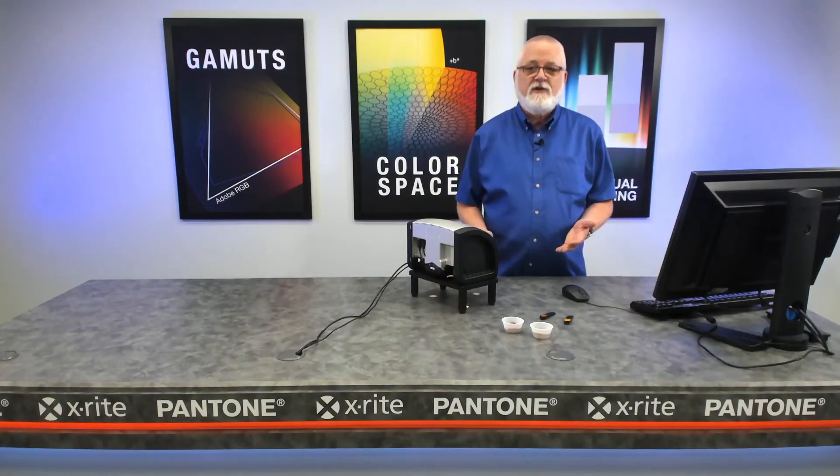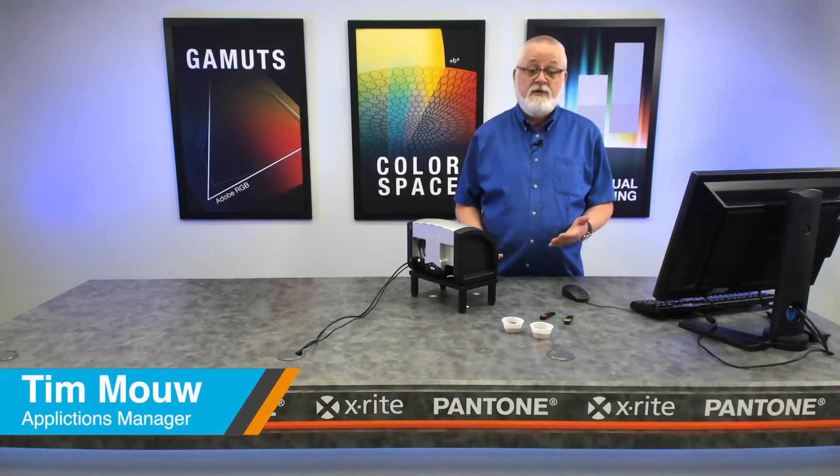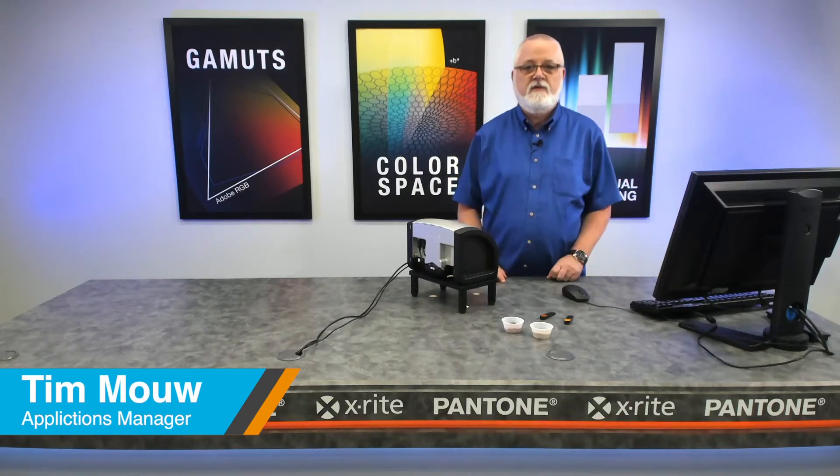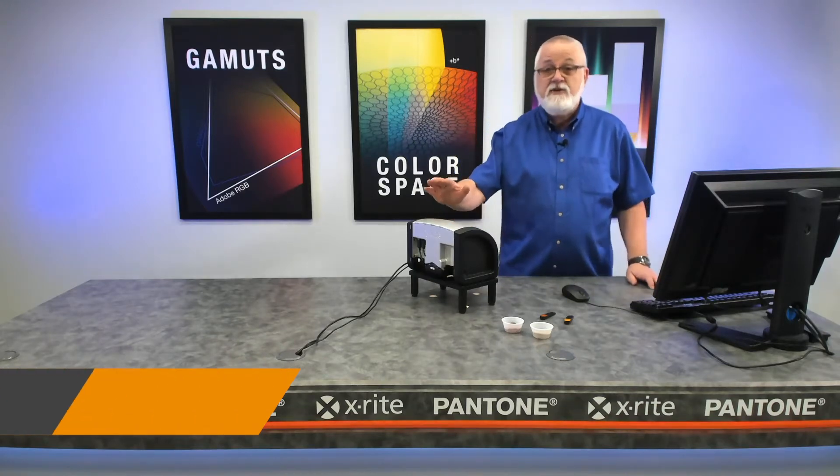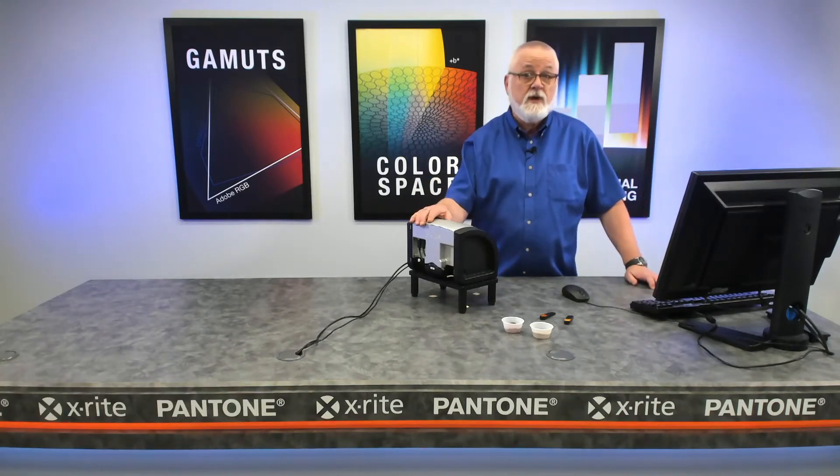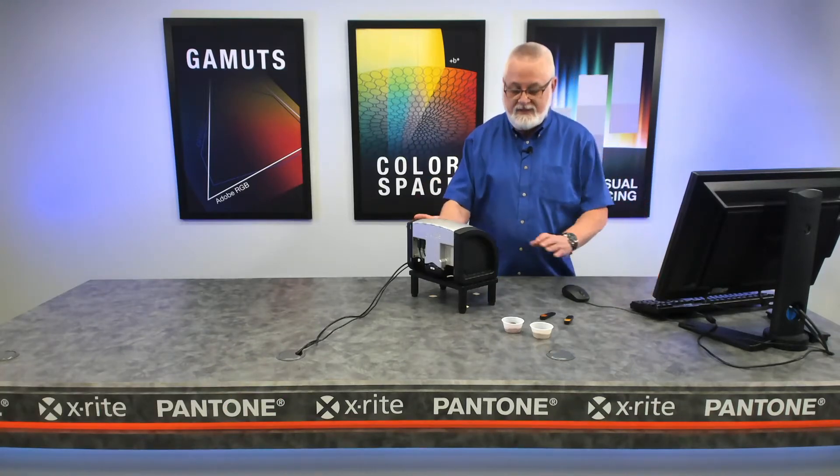So now I'm going to demonstrate for you a means we have for measuring both liquids and powders. We're going to use powders in this example using our MetaView VS3200 instrument.